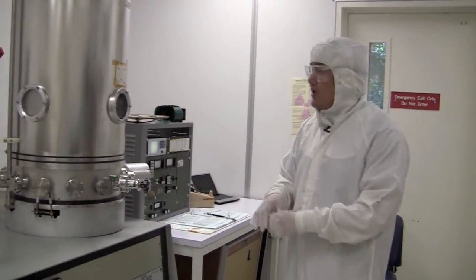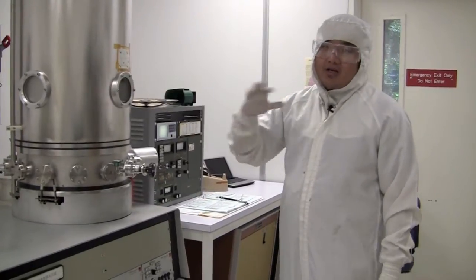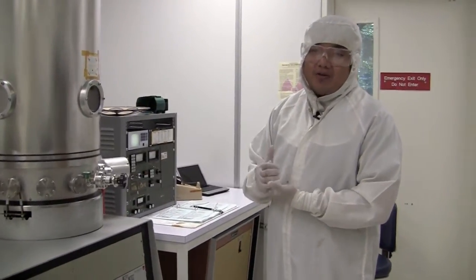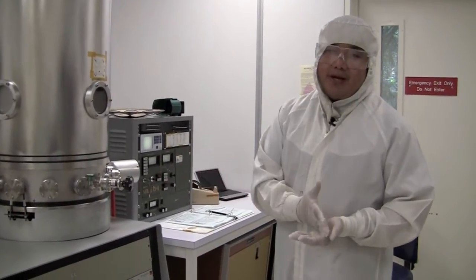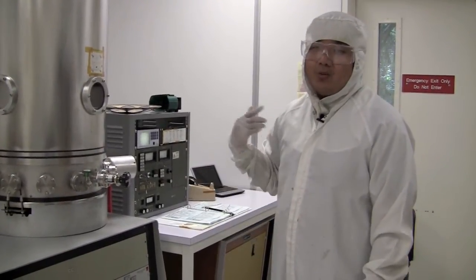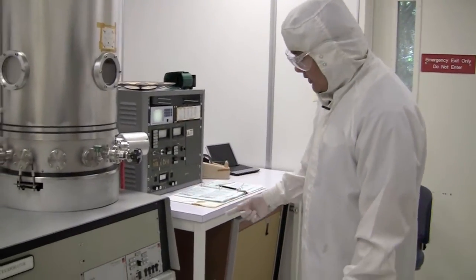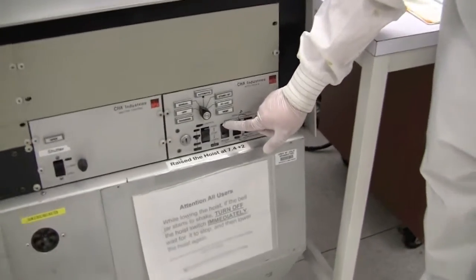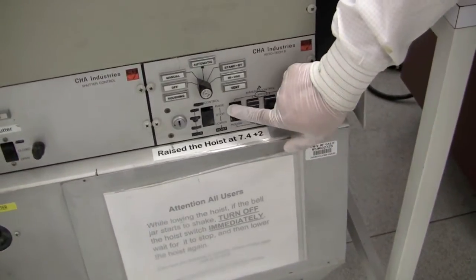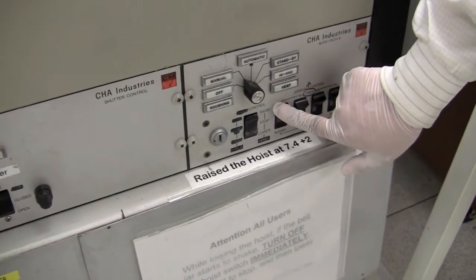So now that we've closed the chamber and our samples are in there and our crucible is there and the shutter is closed, we can begin the pump down process. Right now the system is in normal atmosphere, so we want to bring it down to high vacuum but we can't just jump there, so we need to rough it with the mechanical pump. So the first thing we're going to do is turn the mechanical pump on, which is called roughing. There's a roughing valve here.